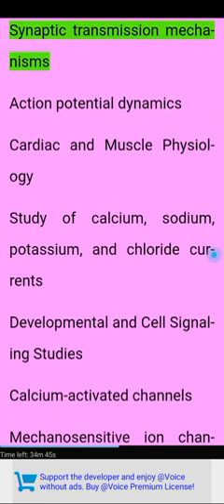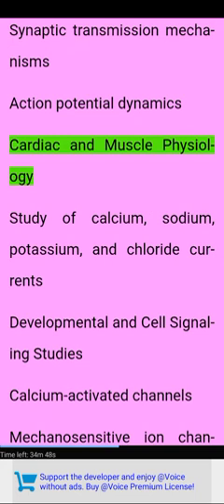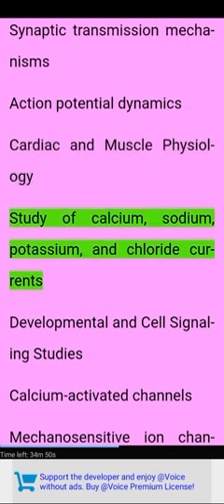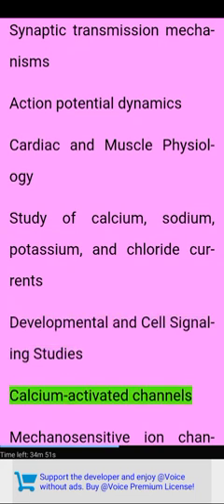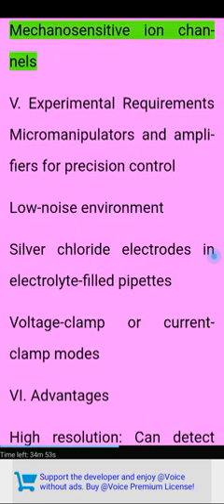Neuroscience: synaptic transmission mechanisms, action potential dynamics. Cardiac and muscle physiology: study of calcium, sodium, potassium, and chloride currents. Developmental and cell signaling studies. Calcium-activated channels. Mechanosensitive ion channels.